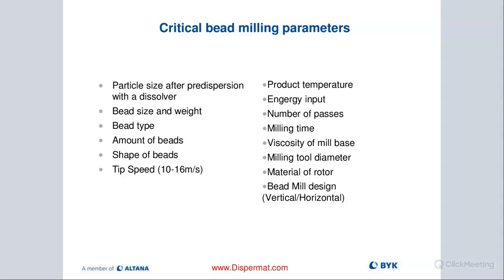The shape of beads: you always want to screen your beads over time. Beads wear. If you use really inexpensive beads, even ceramic beads, you can end up with various shapes. We have seen them show up oval right out of the box, and ideally they should be perfectly spherical if you get a good quality bead.